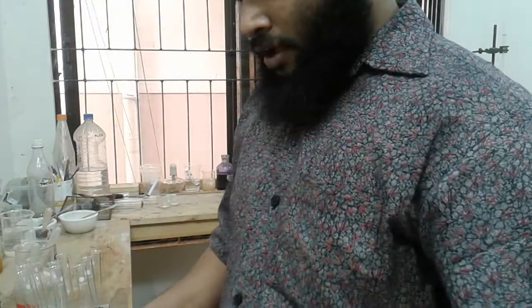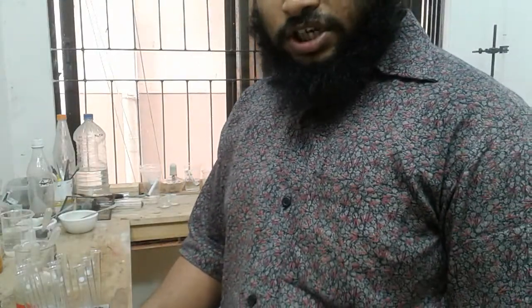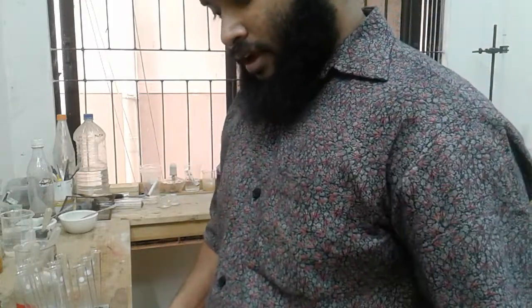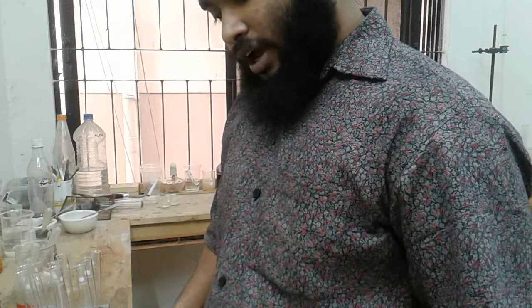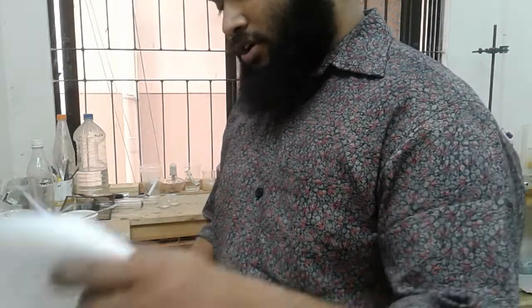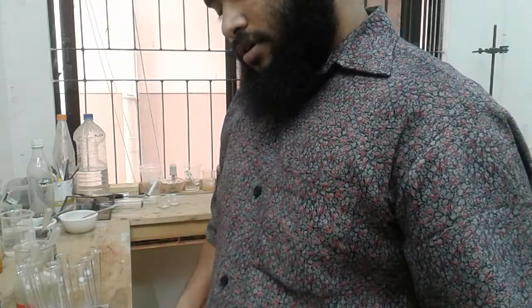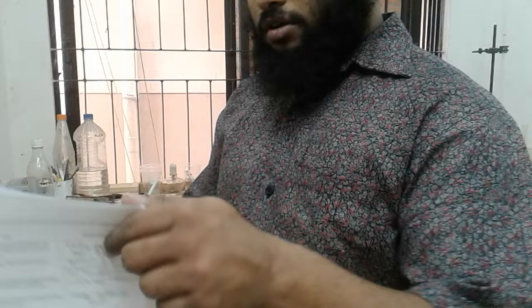Okay, so here we are. Today we will be solving the mock paper of the practical identification test of AS level practical chemistry of Science Academy, and this test is about the skills of identifying various kinds of ions and compounds. In the meantime, here is the sample paper of our candidate who has responded to the question. So let's move on from the first practical.